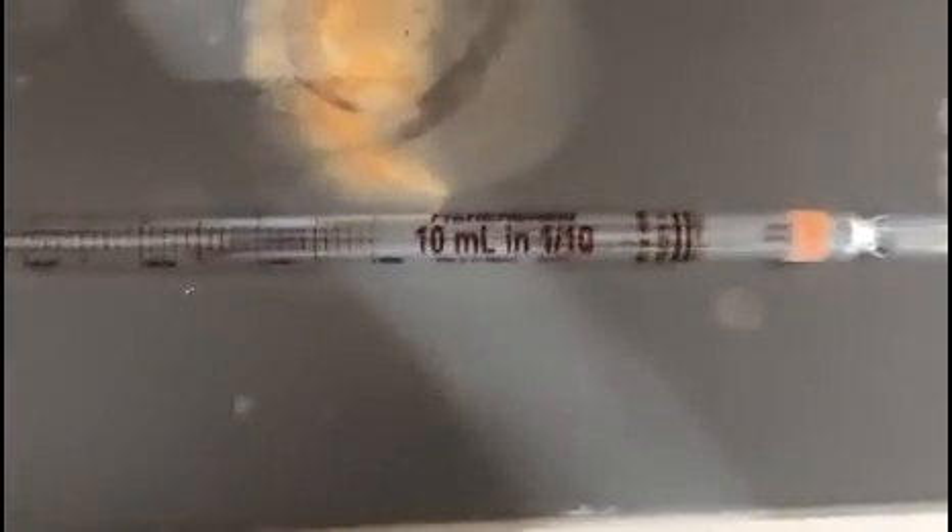For this SN1 lab you will be using a graduated 10 ml pipette. This one is a TD to delivery, and the error on this is 0.06 mls. Additionally, you'll be using a graduated 1 ml TD pipette — the error on this is 0.02 mls.